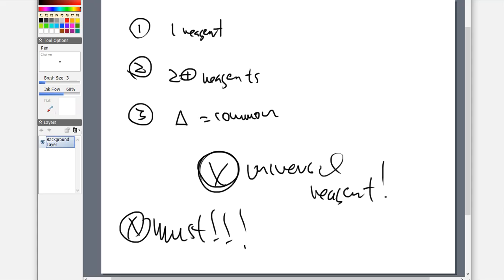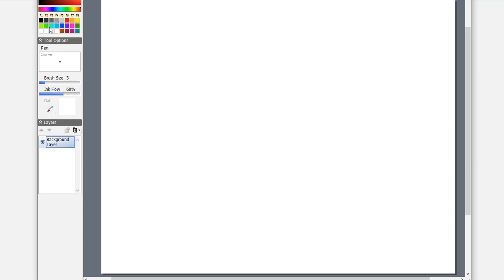And again, it's showcasing the different types of steps that you can do here in the world of HPTLC and so forth. Okay. How can we apply these derivatizing agents?